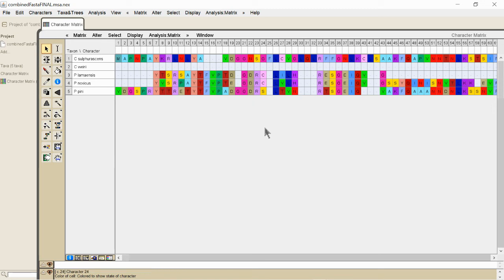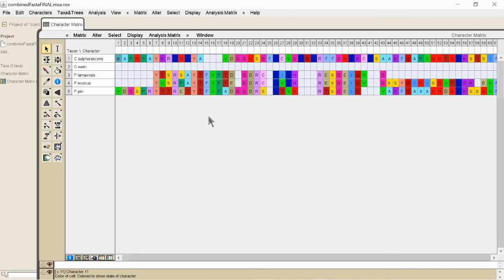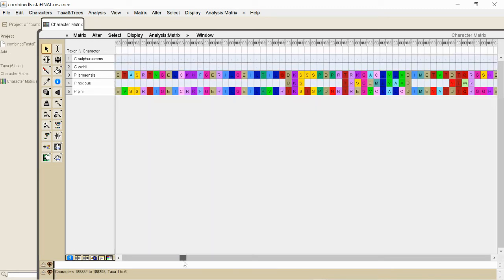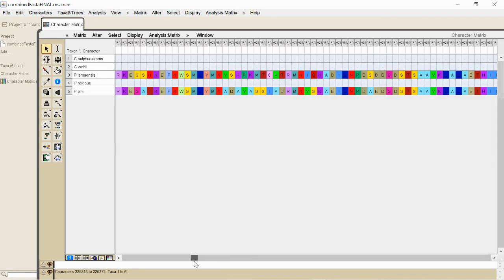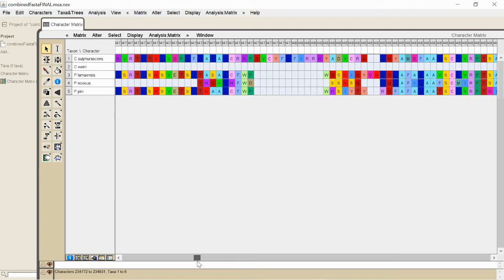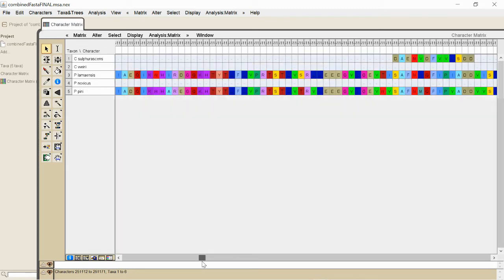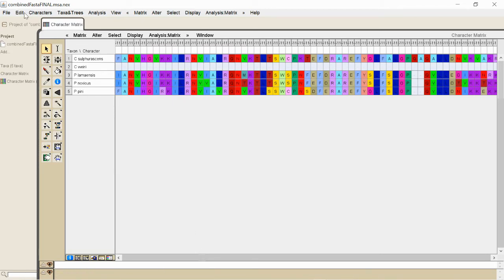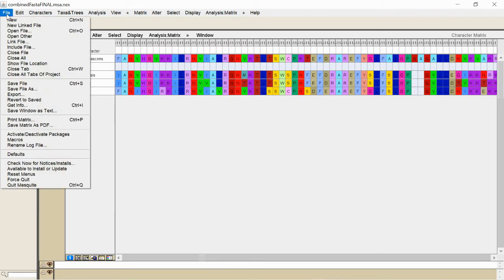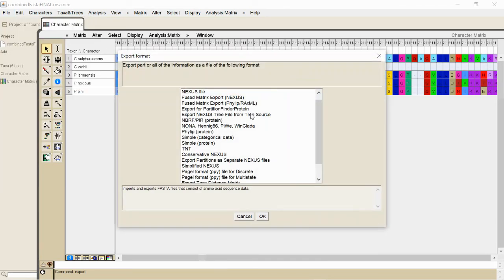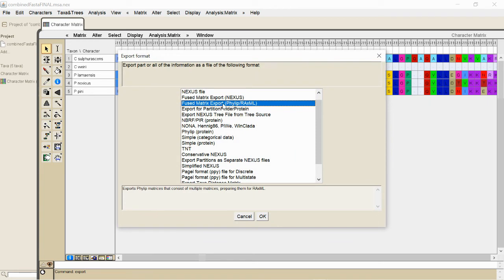So for the very final step here, after you've looked at this visually and ensure that it looks okay, you're going to go up here to File, Export, and you're going to export it as a Fused Matric Export RaxML file.